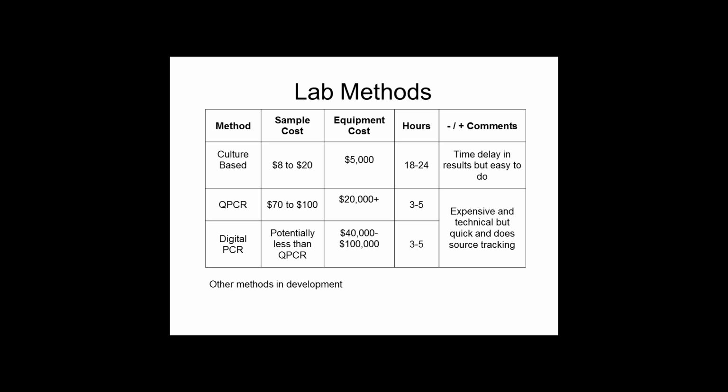The downside of this that we've all been languishing about, just going on and on about, takes 18 to 24 hours to get your sample results with a culture-based method. So that means today I'll collect the water sample and I'll tell you tomorrow if you should go swimming. And we're all very aware of it. It's very frustrating. We'll talk about that throughout this whole conference as to ways that we've gotten over that and how we deal with that.